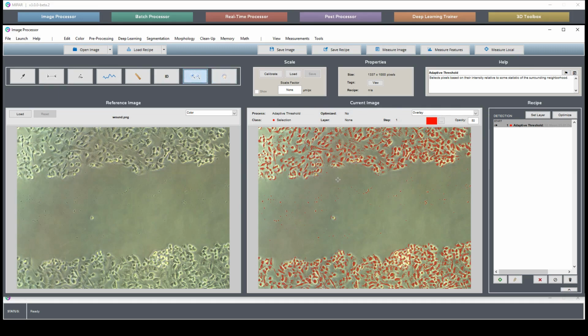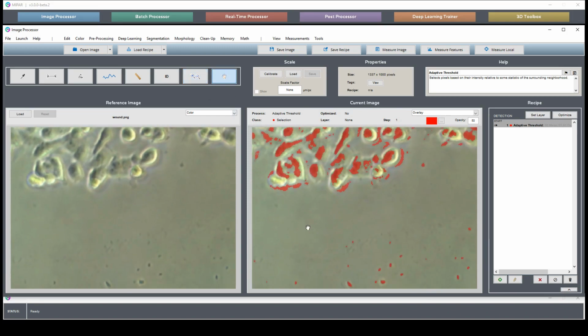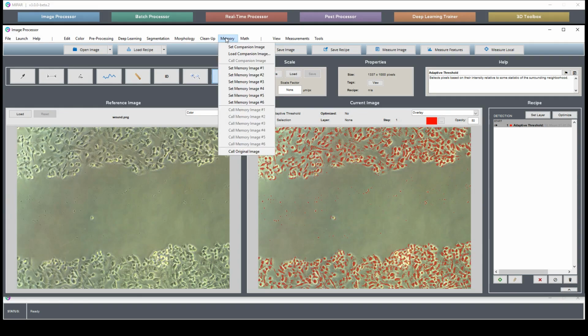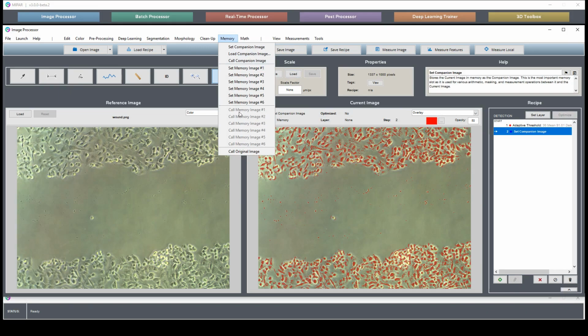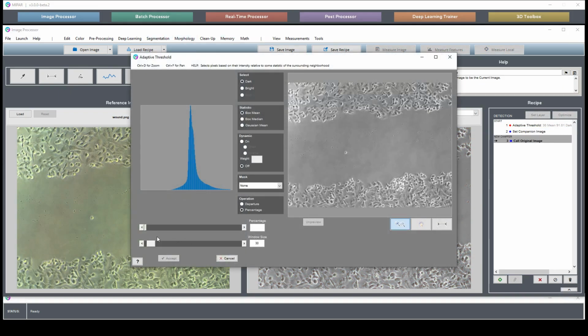And say we wanted to find light areas as well. So not all the cells are dark on the outside, some of them are light. So we could combine these two, a light selection and a dark selection. If I save away our dark selection and then do a light selection, till we have most of, it looks like, these cells highlighted, just like that.